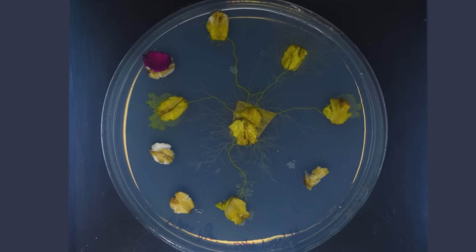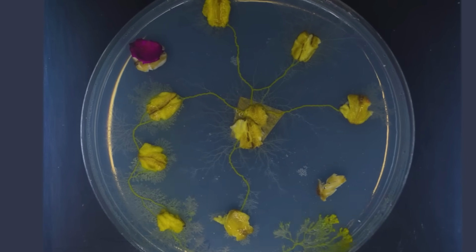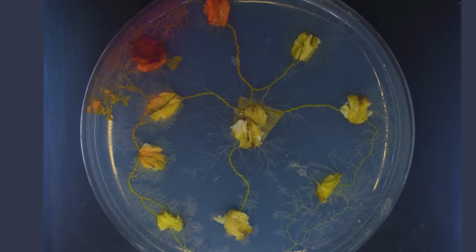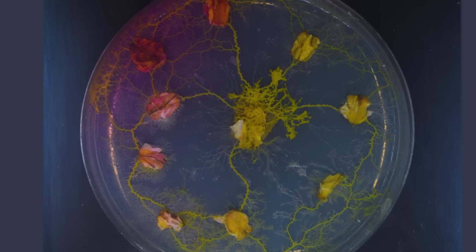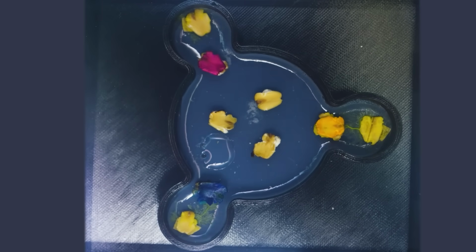What's amazing about this is that if we zoom in a bit, we can actually see how fast the dye moves through Jerry. It is much faster than the passive diffusion of the dye through the agar. We can see that faraway oats take on a pink tinge almost immediately after Jerry makes contact with the dye. But then we see Jerry's whole body take on an orange hue. Let's try this again with more colors.